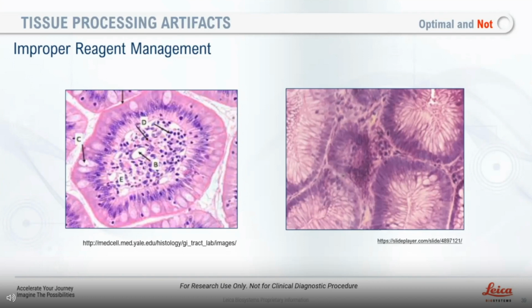Once it's processed, and this is my opinion and what I've talked to other techs about and their experience, the tissue, once it's processed, is processed. So if you feel like the embedding is going to be delayed, then there's not a problem leaving it out.